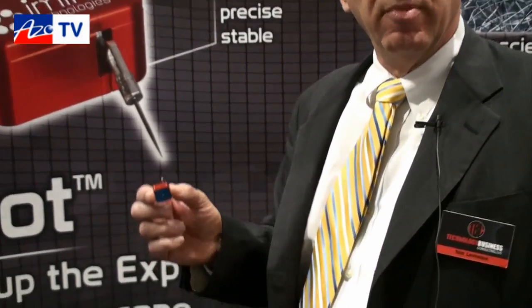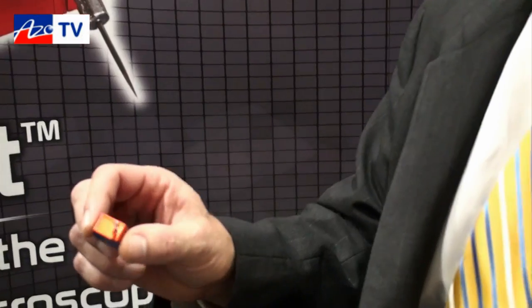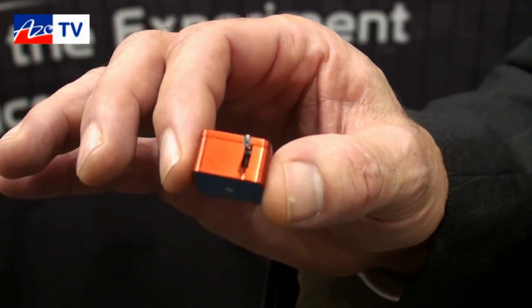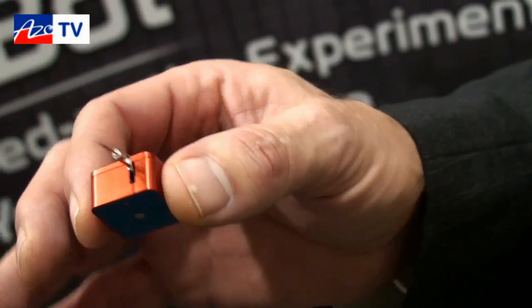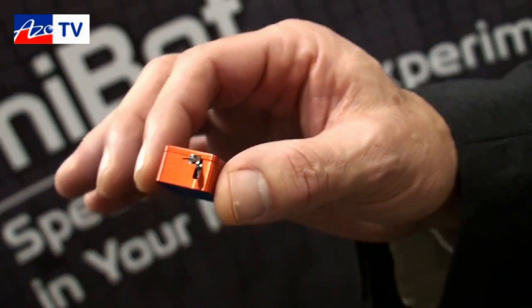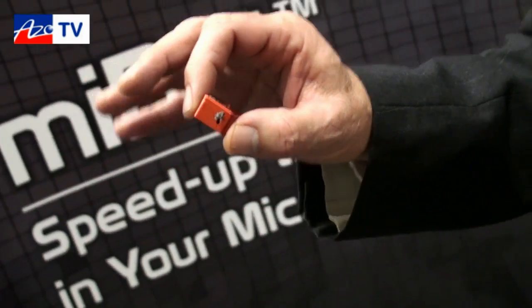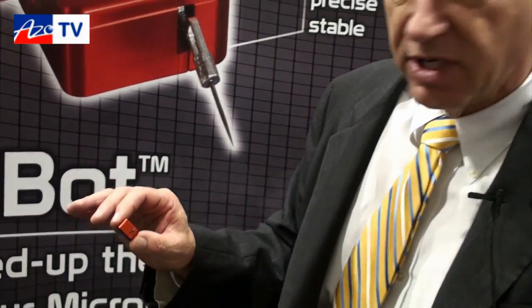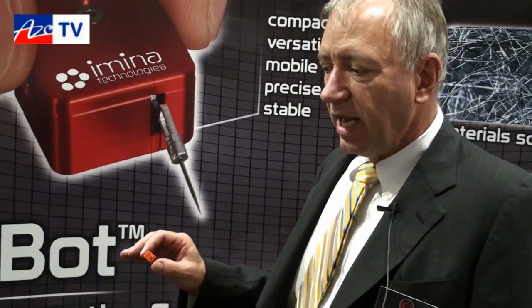These are nano manipulators, and they are, as you can see, very, very small. They have the ability to move over large ranges, and they are virtually untethered, which means they're not anchored down. There is a small umbilical connection to them that provides information and power to them, but they can operate either in an electron microscope or in an optical microscope environment and move untethered, unencumbered, around the sample.